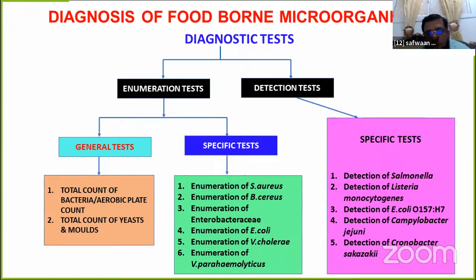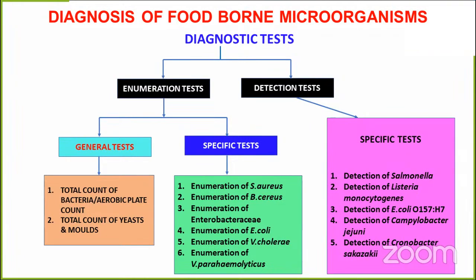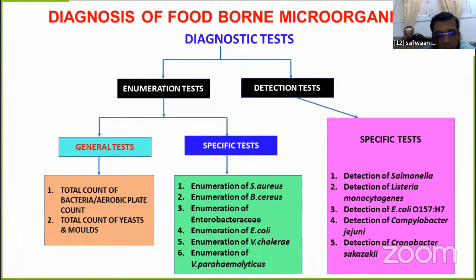So any person might have a doubt about how many counts we will do in each test. Will we do all the counting, or will we do specific ones? It depends on the limits which I have shared just now. So each sample sometimes has 3 tests, sometimes has 5 tests, based on the limit set by the GSO, which in turn is coming from Codex Alimentarius.